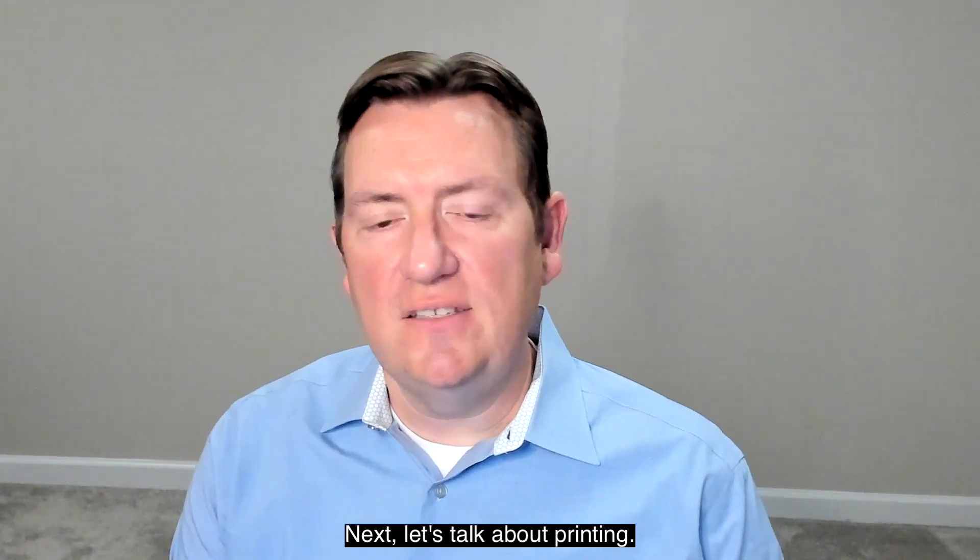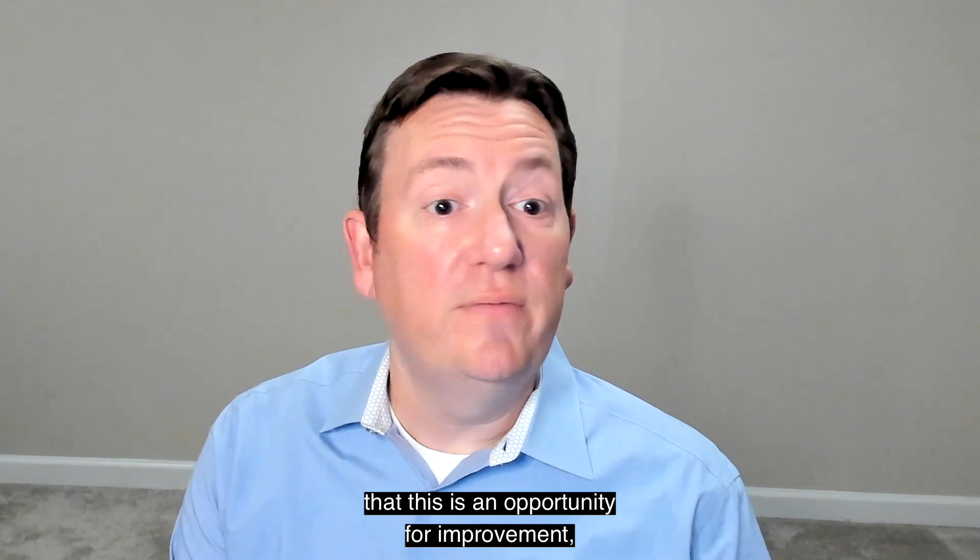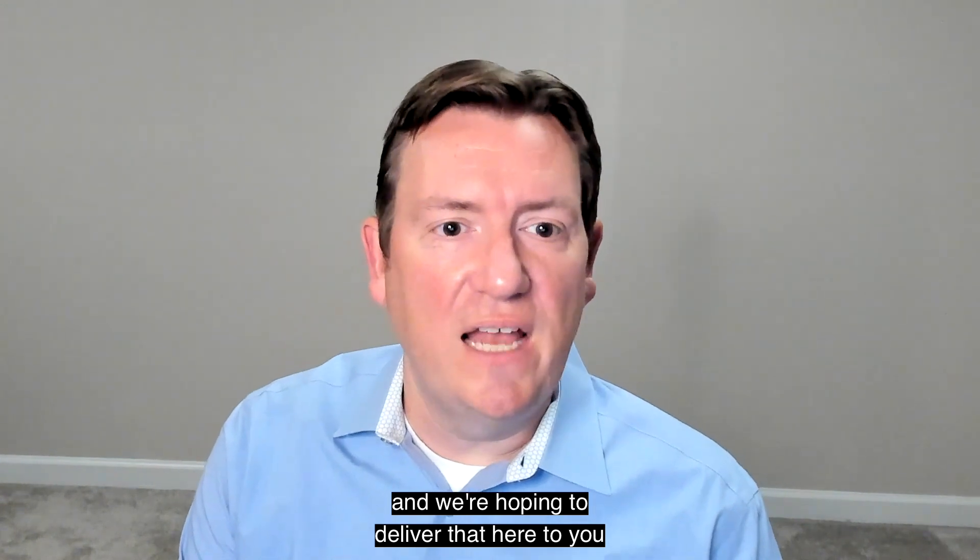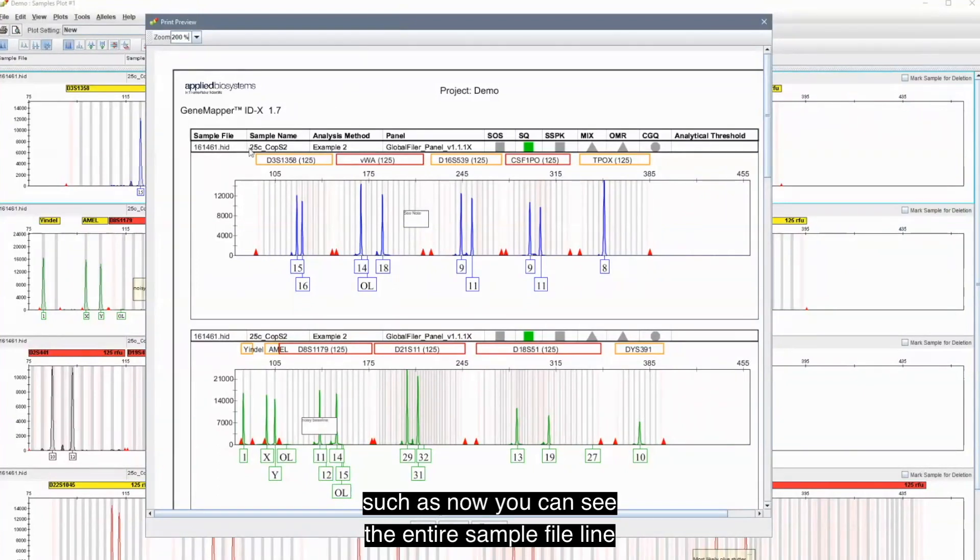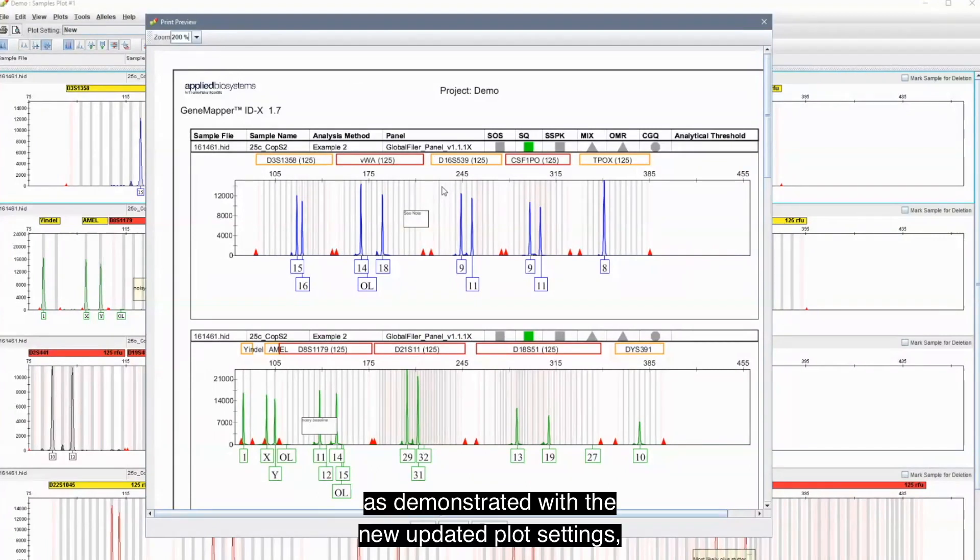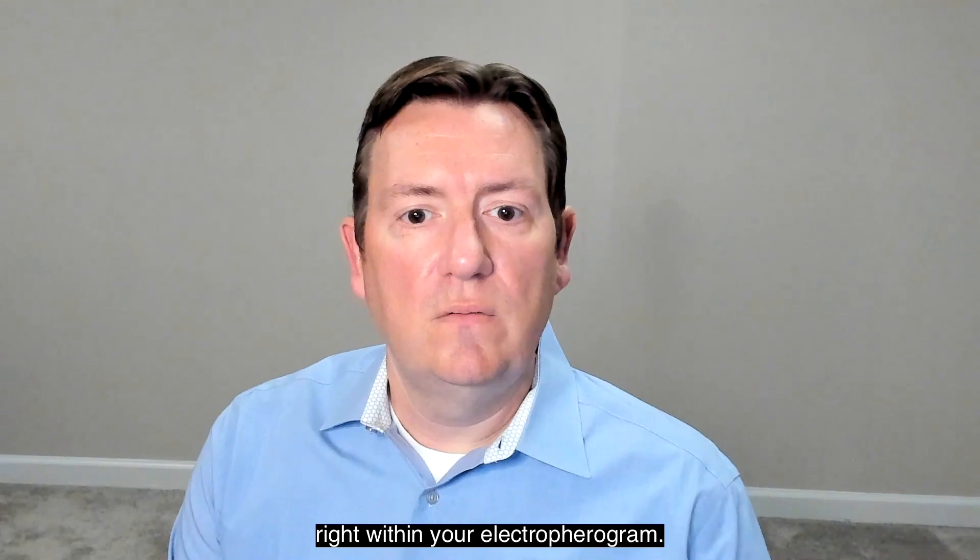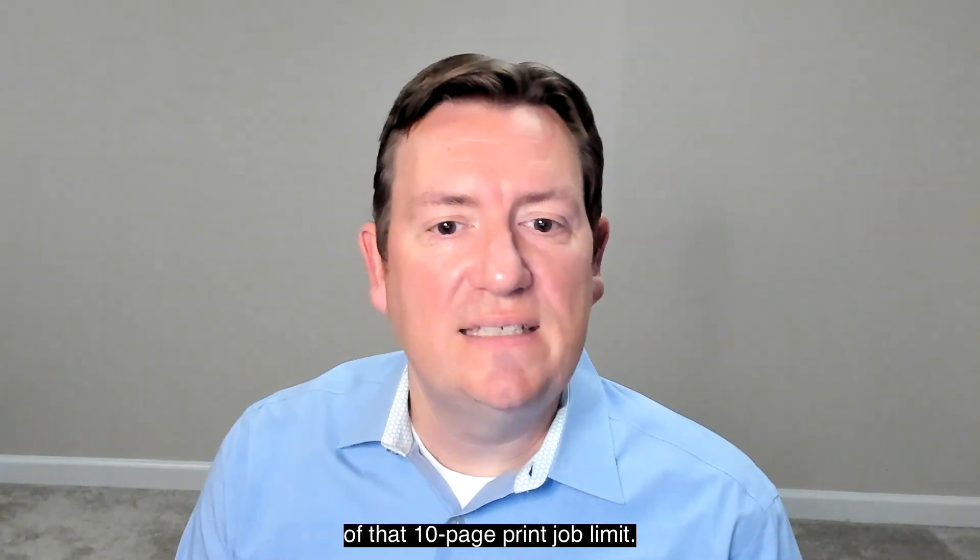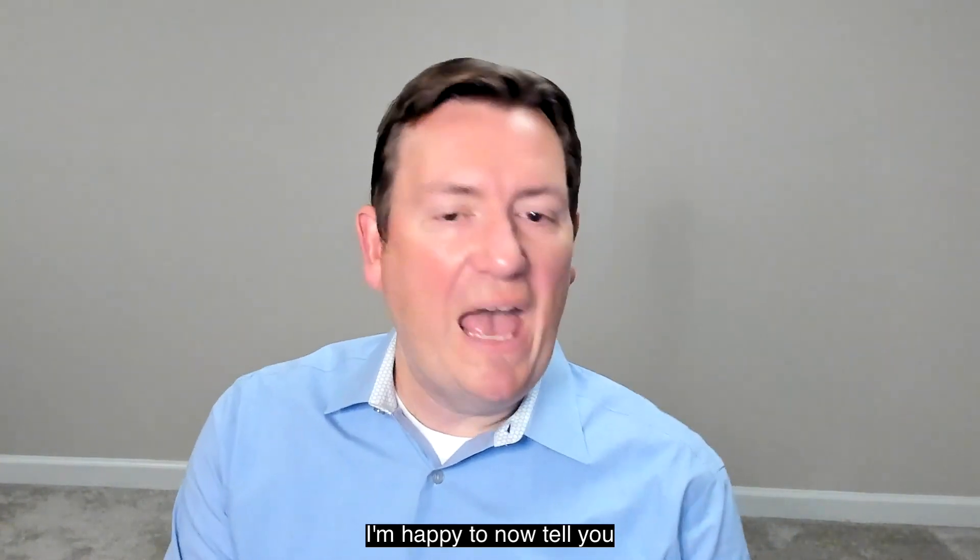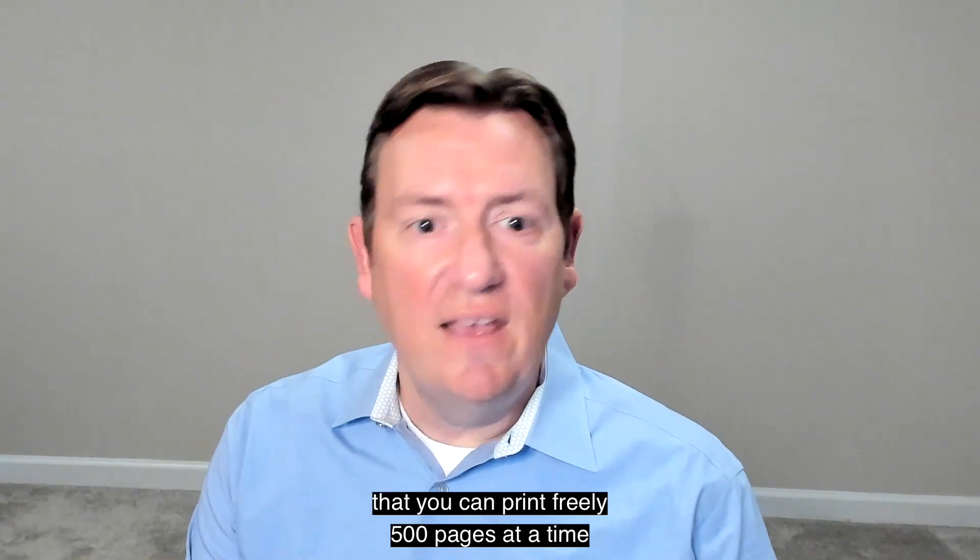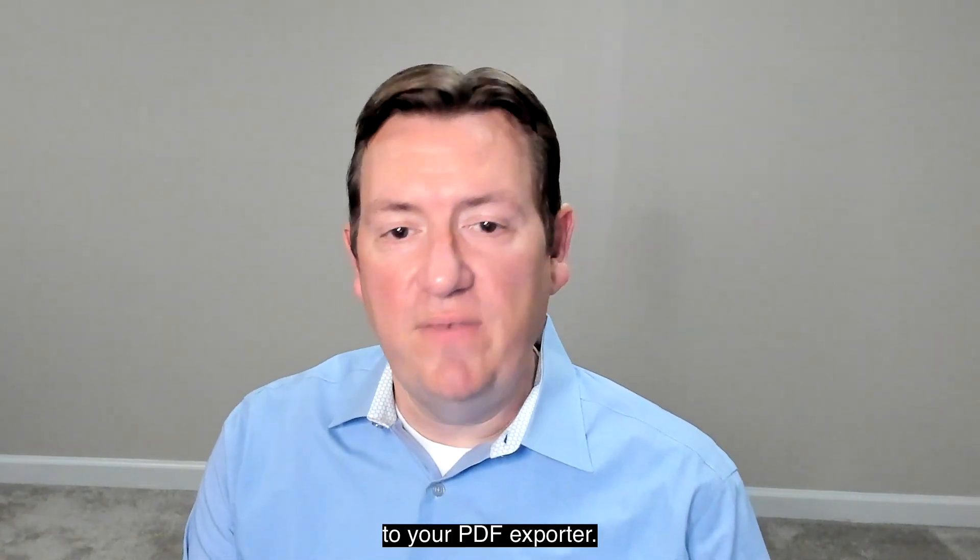Next, let's talk about printing. We've heard from plenty of you that this is an opportunity for improvement and we're hoping to deliver that here to you in GeneMapper IDX version 1.7. We've cleaned up a lot of the print formatting issues, such as now you can see the entire sample file line within your Electropherogram. Also, you can see as demonstrated with the new updated plot settings, you can read your analysis method as well as your panel and your notes will be annotated right within your Electropherogram. Finally, we've gotten rid of that 10 page print job limit. I'm happy to now tell you that you can print freely 500 pages at a time to your PDF exporter.